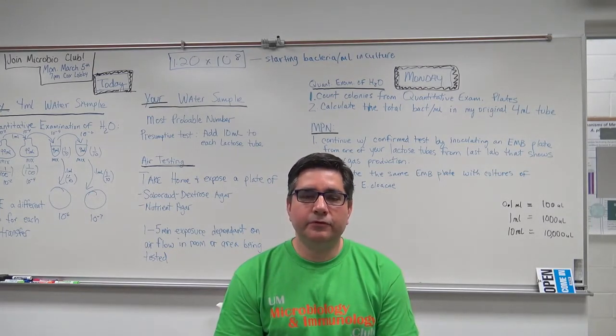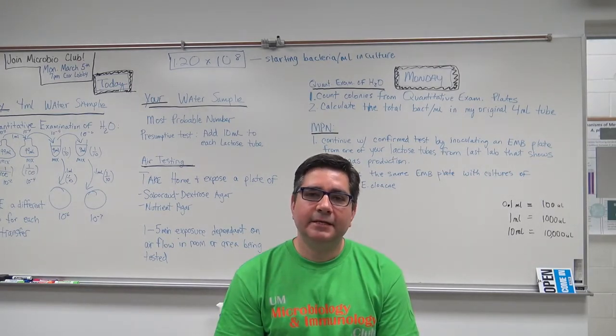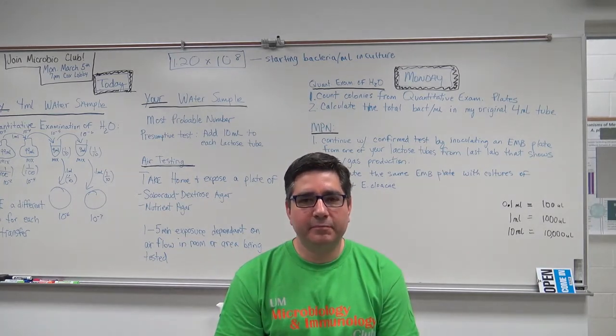Each tube for the dilution has a dilution factor. Each dilution factor is multiplied by the next. Take note that the 0.1 ml you will be plating is another dilution you must factor in when you are calculating the dilution factor of the plate you will be inoculating.